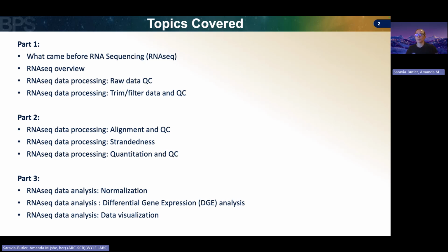You'll then come back here for part 3 of this lecture, which will cover beginning with analysis of the RNA-seq data, starting with normalization of those data, followed by differential gene expression analysis. And lastly, we'll briefly touch on the data visualizations that you'll be generating in the hands-on portion. You'll then hop to the GL4U analysis portion of the hands-on part of the GL4U RNAseq module set.